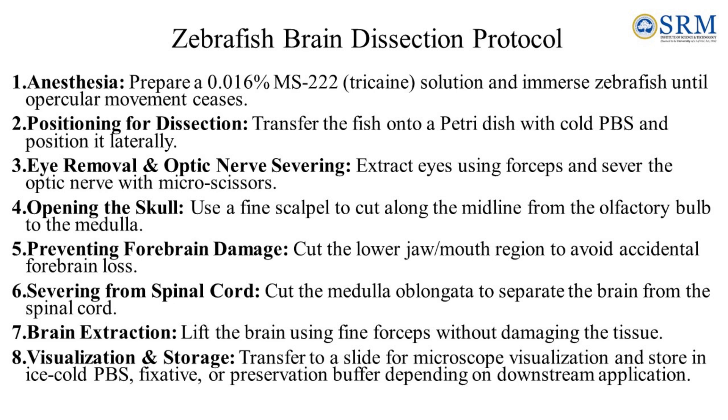Step 2, positioning for dissection: transfer the zebrafish onto a petri dish with ice cold PBS and position the fish laterally. Step 3, eye removal and optic nerve severing: extract eyes using forceps and sever the optic nerve with micro scissors. Step 4, opening the skull: use a fine scalpel to cut along the midline from the olfactory bulb to the medulla. Step 5, preventing forebrain damage: cut the lower jaw or mouth region to avoid accidental forebrain loss.